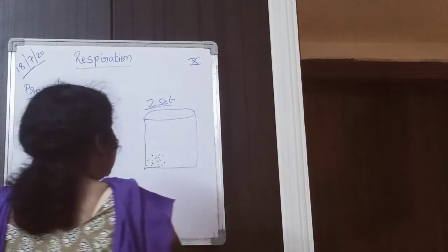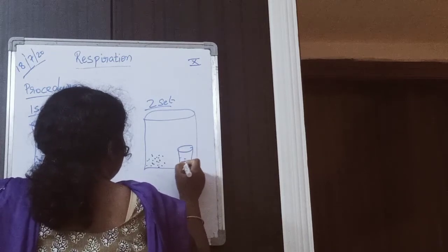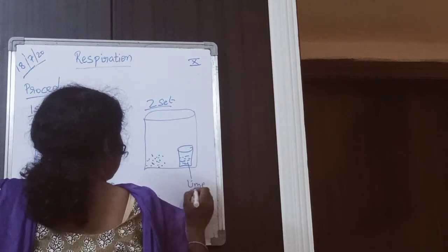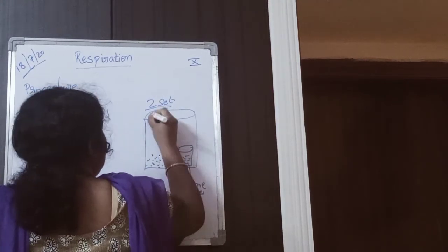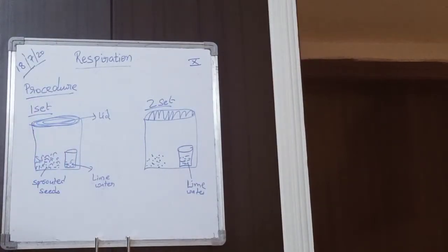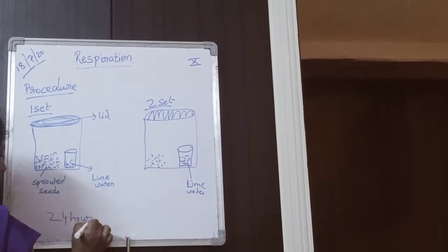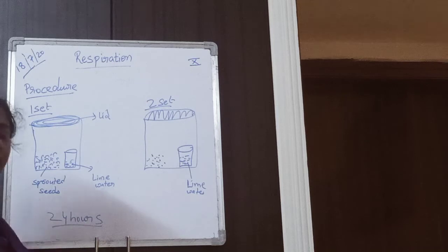Keep the same beaker containing lime water. Now close the lid. Leave these apparatus for 24 hours. Next day after coming, observe the two apparatus.